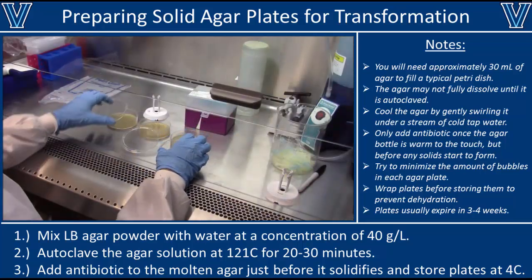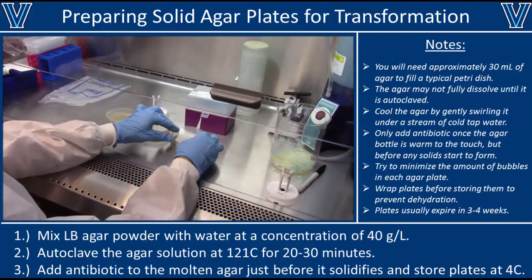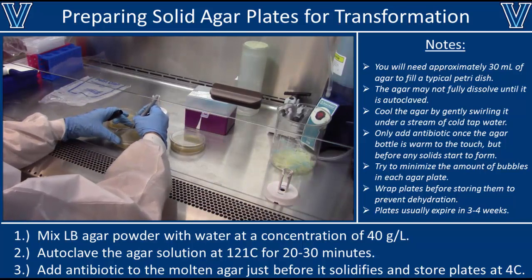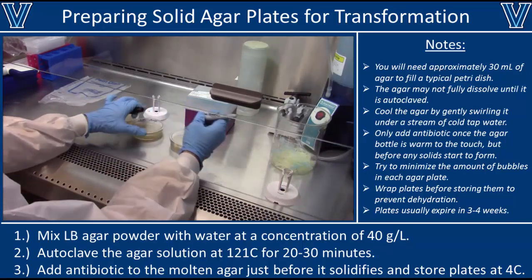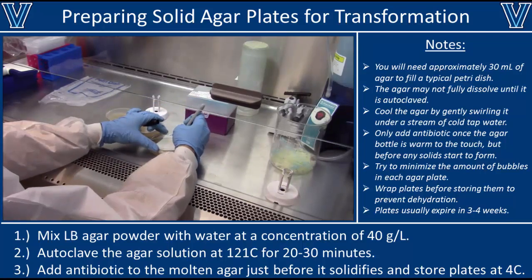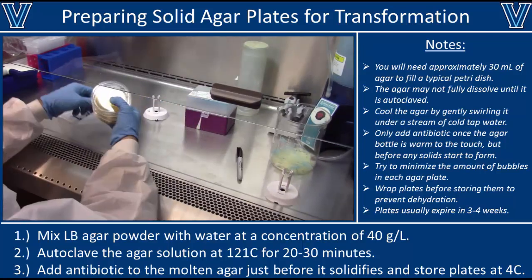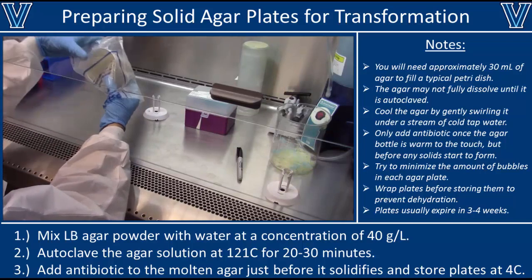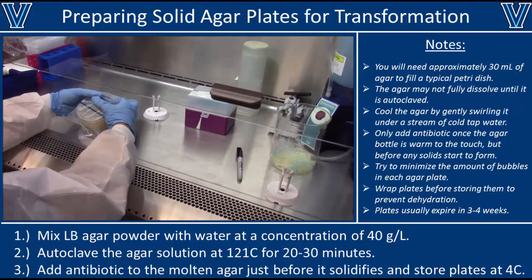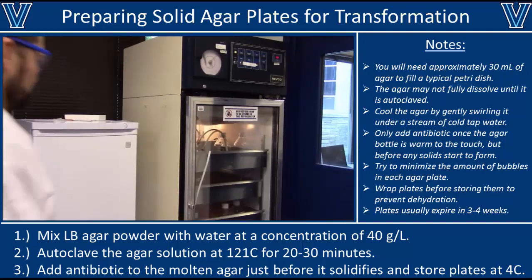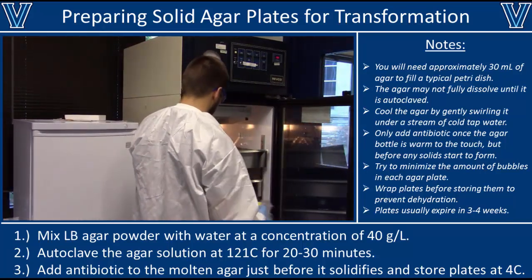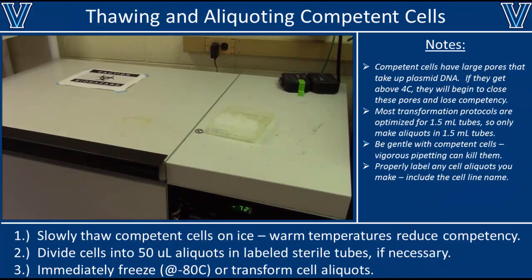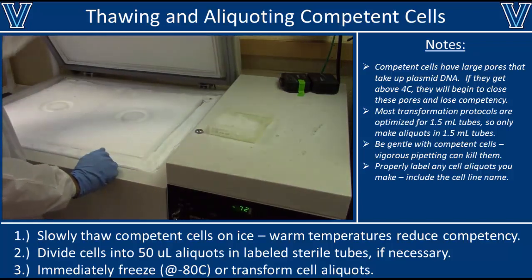Leave the poured plates in the BSC for an hour to solidify. Once they've solidified, put the lids back on and label them appropriately — include the type of media (LB) and the type of antibiotic used, in this case ampicillin. Carefully label each plate, then wrap them in plastic or foil to keep them from drying out. Once wrapped, you can keep them in the fridge for up to two to three months, depending on the antibiotic.